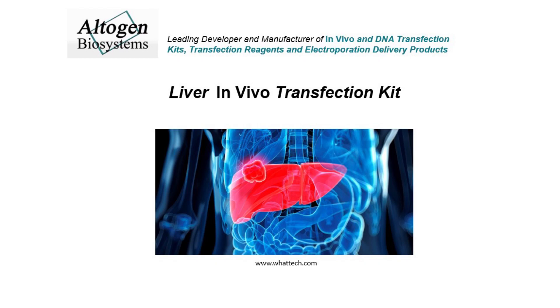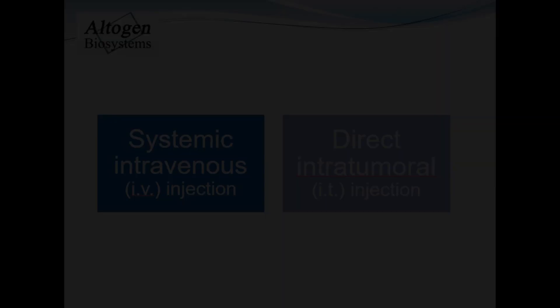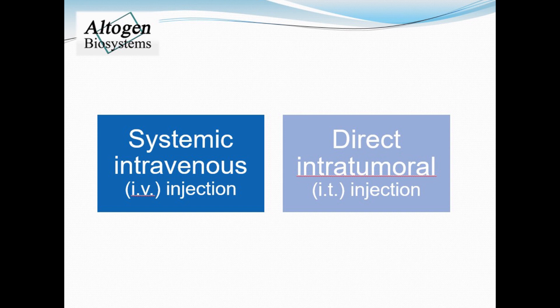Today we will be demonstrating how to use the liver-specific in vivo transfection reagent manufactured by Altagen Biosystems. First you must decide on a route of administration. Here we present a tutorial for tail vein IV or intratumoral IT injections in mice.